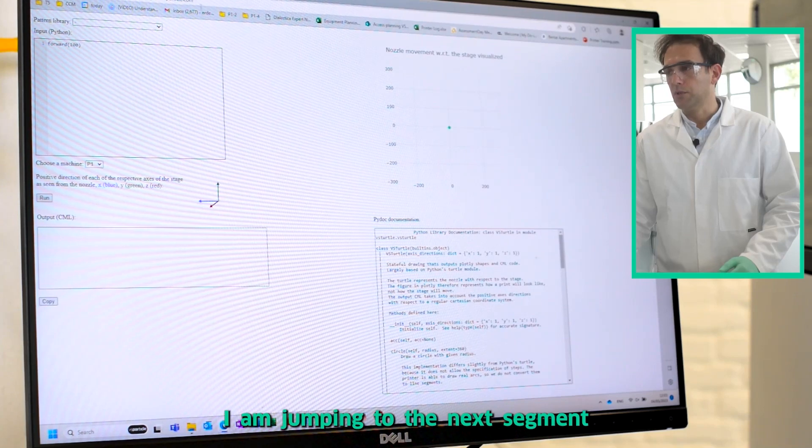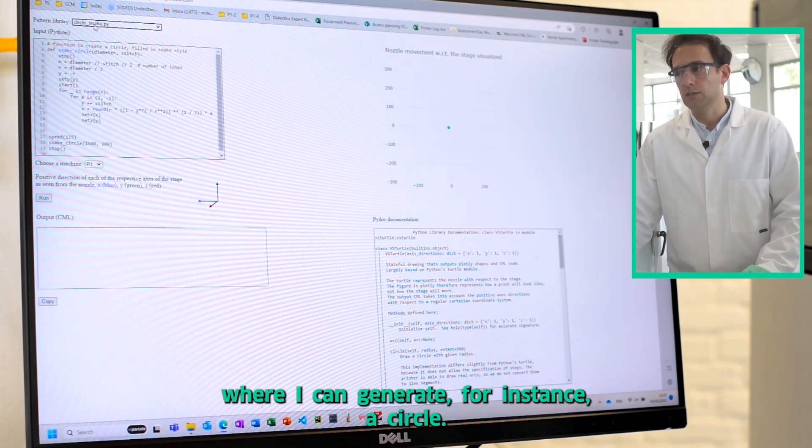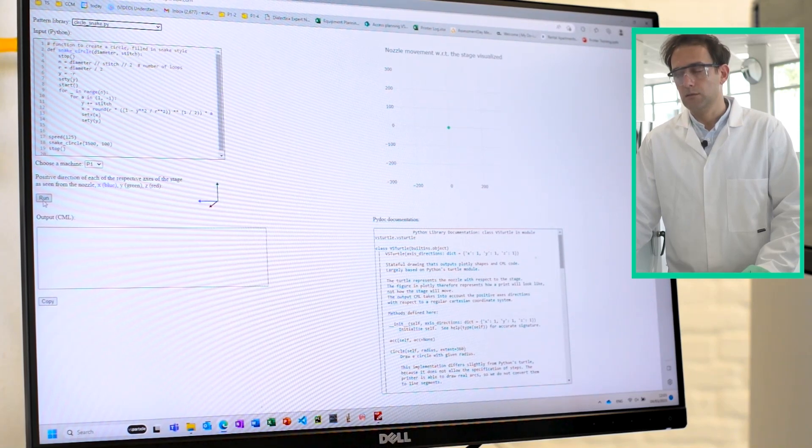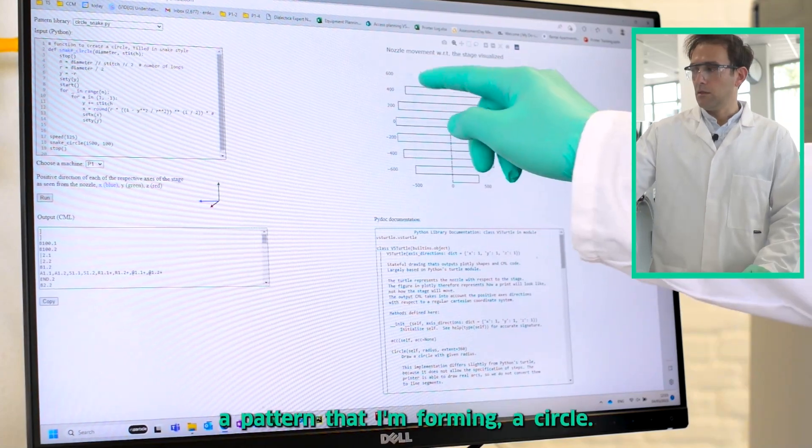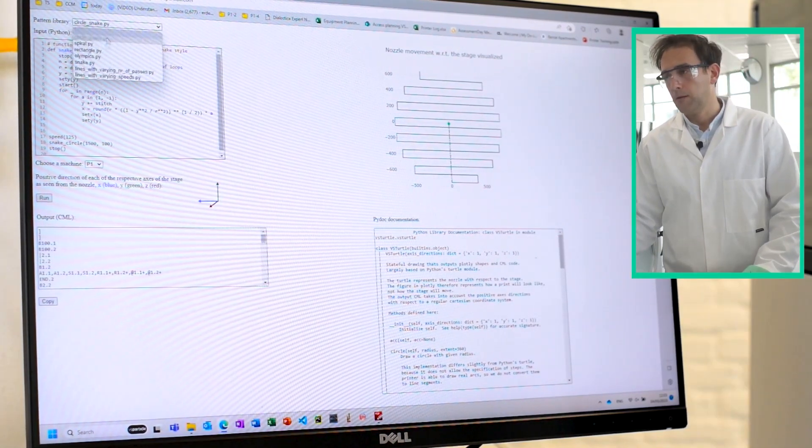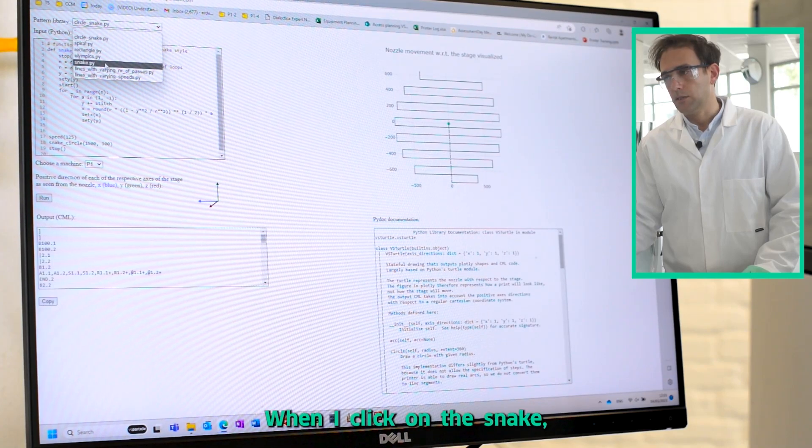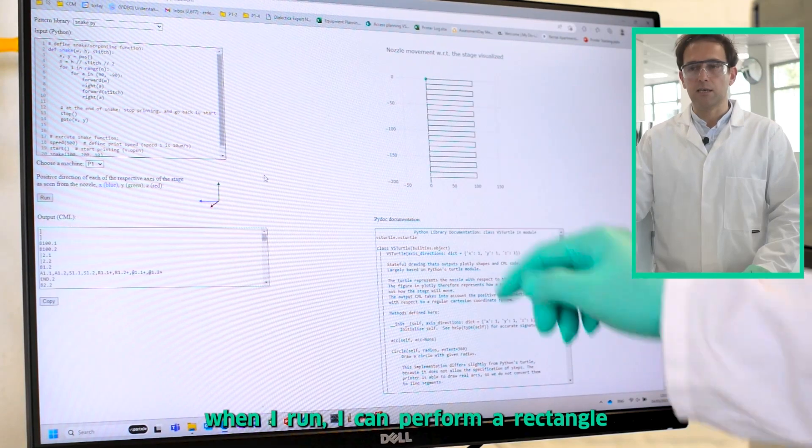I am jumping to the next segment where I can generate, for instance, a circle. When I click on run, I see a pattern forming a circle. When I click on the snake and run, I can perform a rectangle.